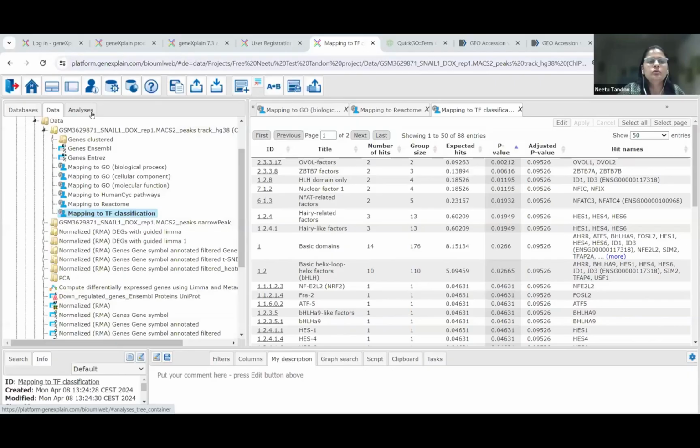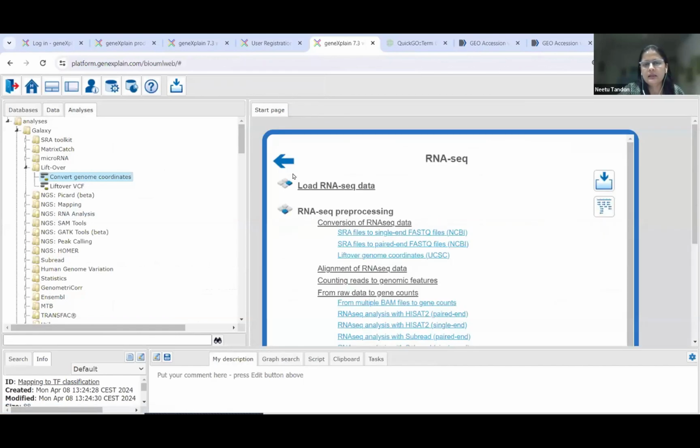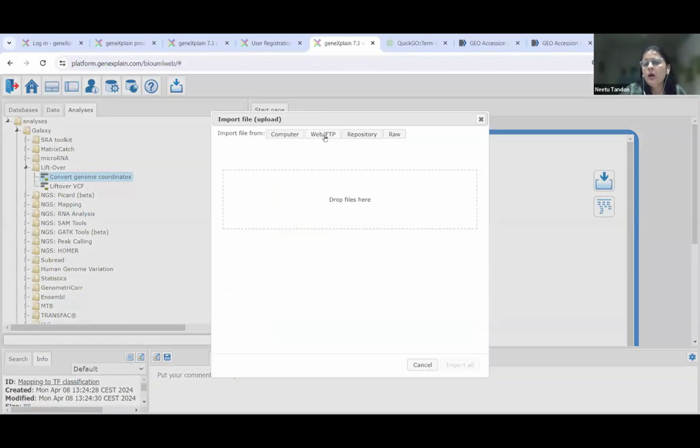I have to share my screen. Yeah, so if I go back to the RNA-seq tab, you can just load your FTP link. You can take the FTP link from your SRA folder and directly upload the entire thing here. There is also an option to import all. So when you are uploading bulk files, there are many files, and you can directly upload all of them. If it's a zip format, it will be detected as a zip format.